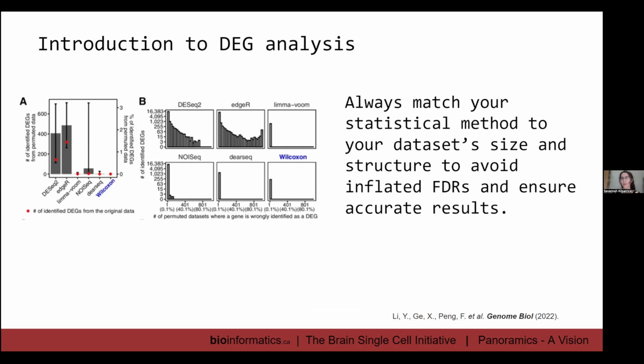So if you have really low values, it's looking at the ranks and not the exact value of that gene. So it's good in that sense, whereas DESeq2 and even edgeR are really good for mitigating batch effects. They can apply covariate analyses that mitigate variables like batch or sex or what have you. So again, it just depends on what your priorities are and what kind of analyses you want to perform.